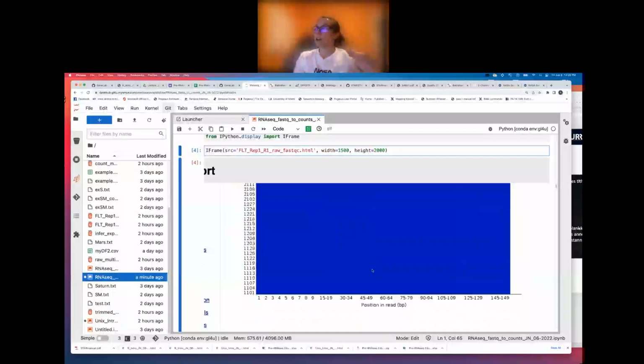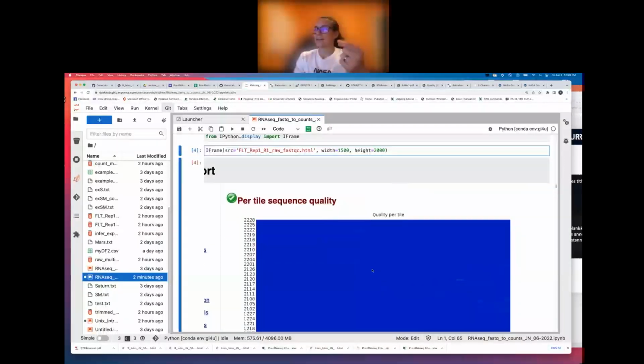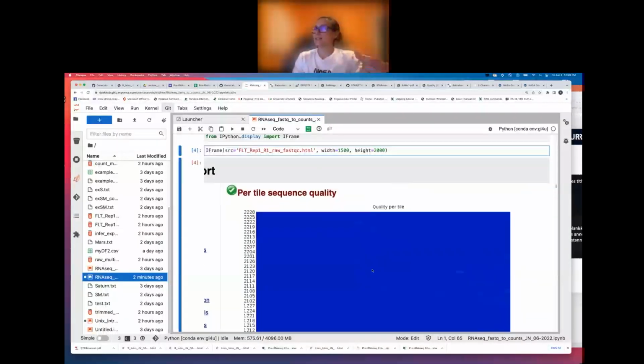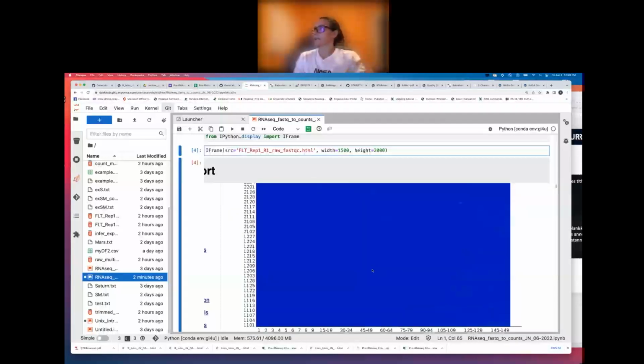I'm not entirely sure how to interpret this. I don't usually pay too much attention to it. I don't know if Lauren and Mike have looked into this since we talked about it, but feel free to chime in if there's anything you want to say about the per.